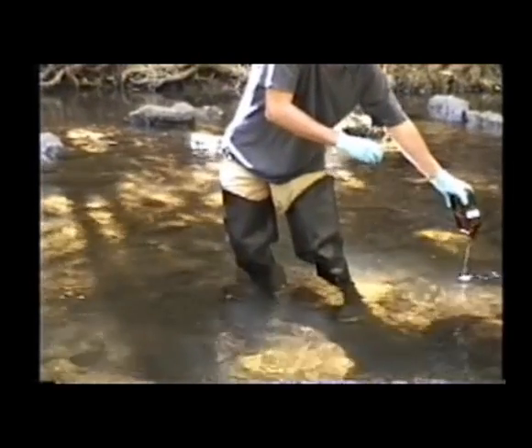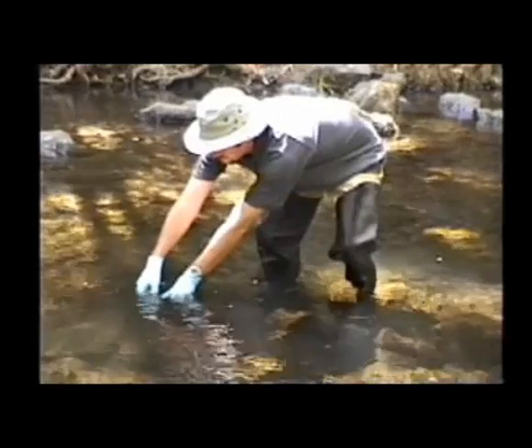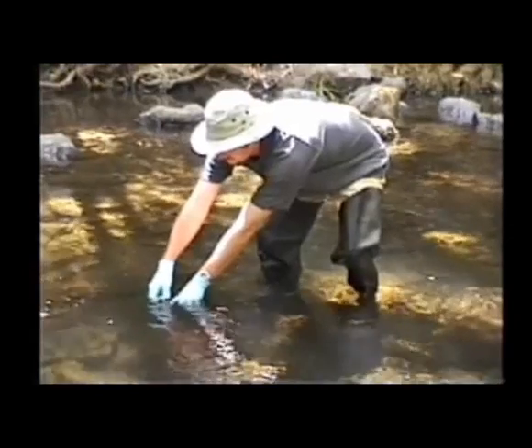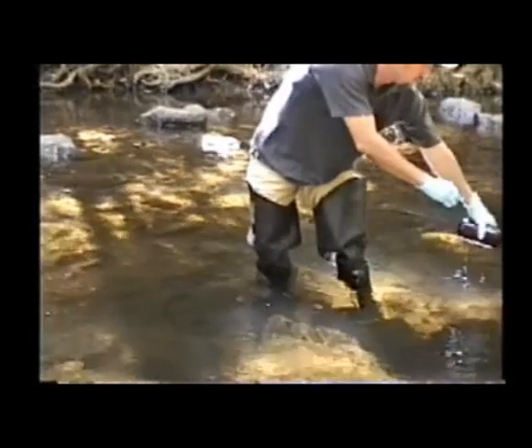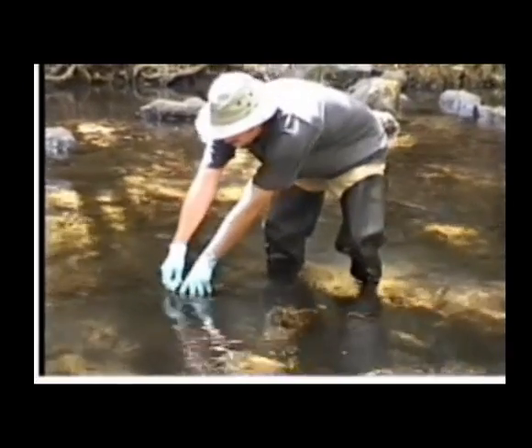He will do this 3 times, each time putting the bottle facing upstream, removing the cap under the surface of the water, allowing it to partially fill, capping it underwater, agitating the bottle, and then disposing of the rinsate behind him downstream. After the 3rd rinse has been completed, the sample is then collected.